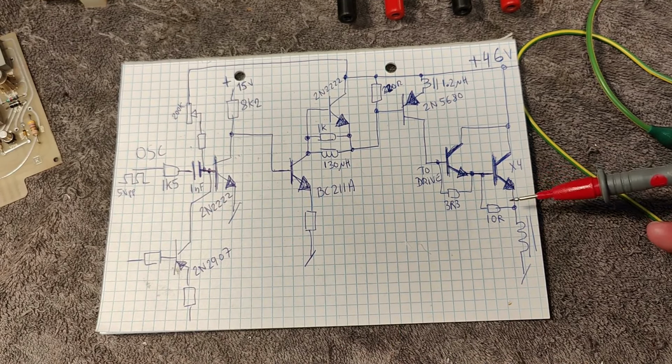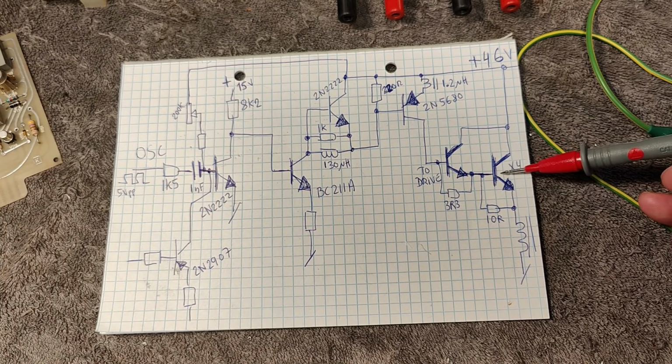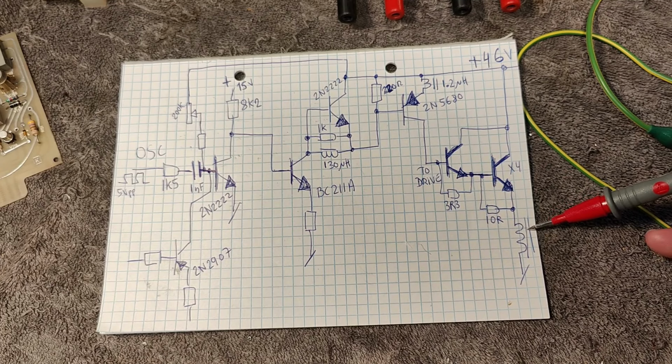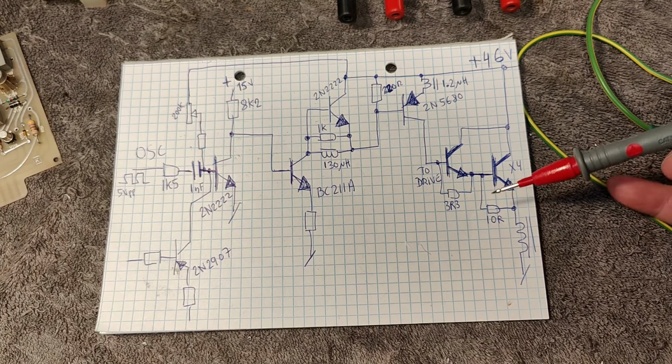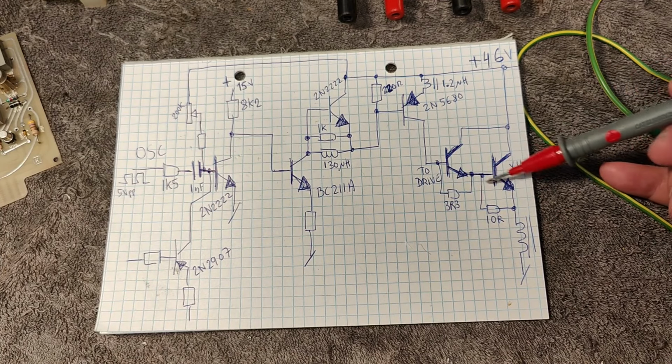And let's take it from the back. We got 4 parallel NPN transistors, and they are driving all 4 primary windings on all the high voltage transformers. So of course this is just a classic pre-driver, and it's a Darlington sort of system, right? And then we got this PNP transistor, and this one is turned on by pulling this one low. So you pull the base low, and then you activate this PNP transistor.